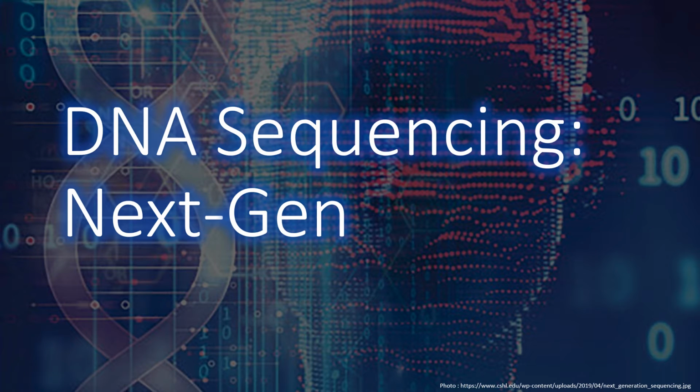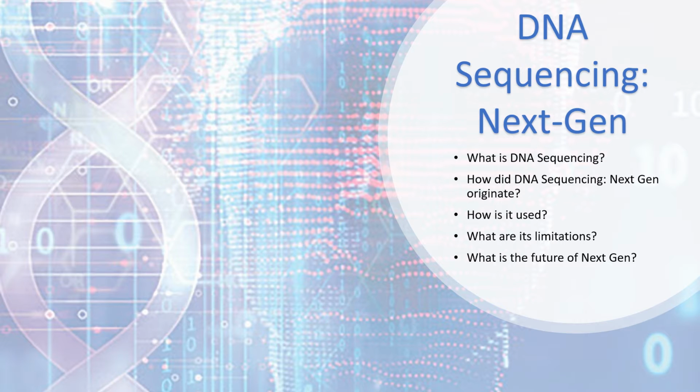Hi, my name is Lala Bimanan, and today we're going to learn about DNA sequencing next generation. So here are a few of the topics we're going to cover. What is DNA sequencing? How did DNA sequencing next gen originate? How is it used? What are its limitations? And what is the future of next gen?